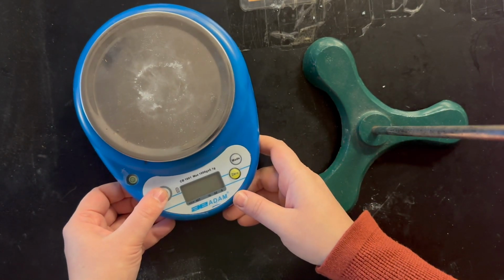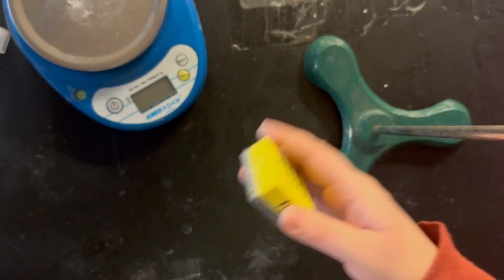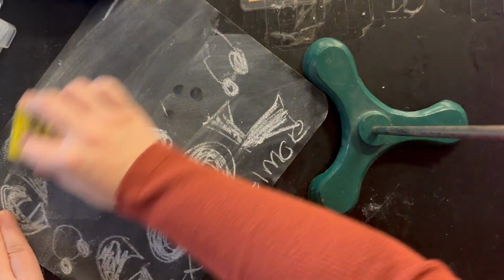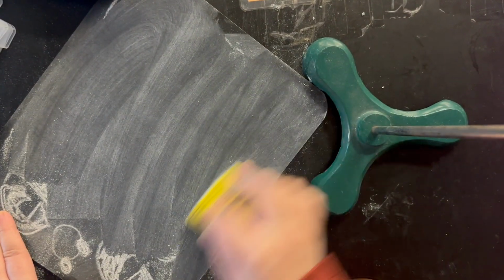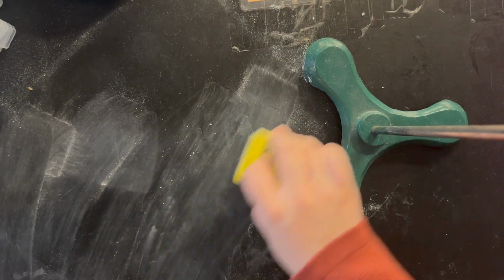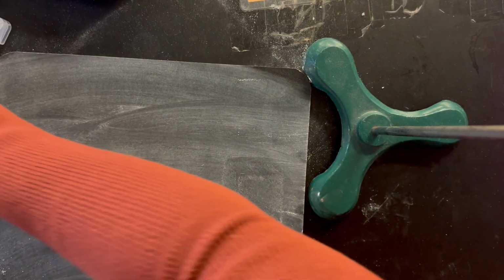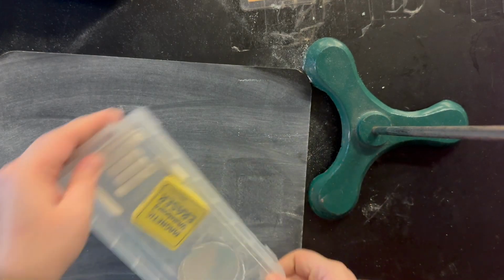Turn off your scale, make sure it is off. And then before you put this away, say goodbye to your creation and give it a lovely erase. Things may get a little chalk dusty. That comes with the nature of the territory. But that is it.